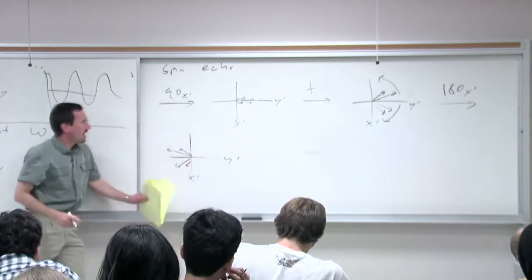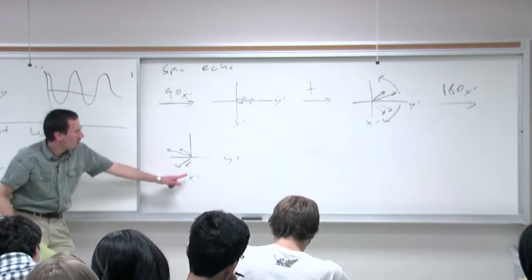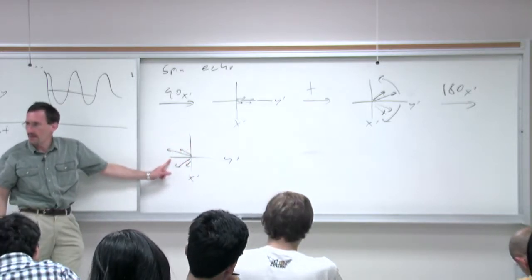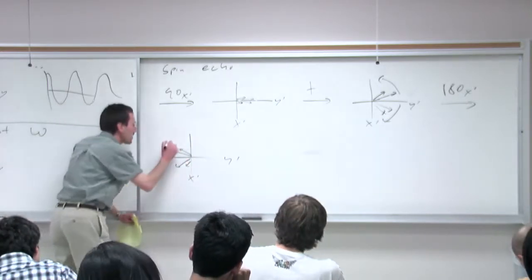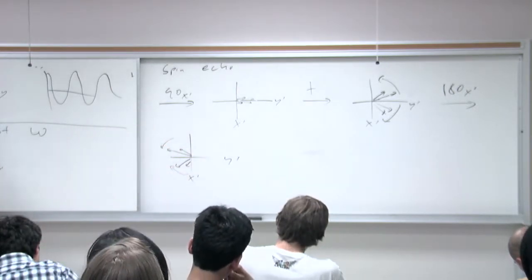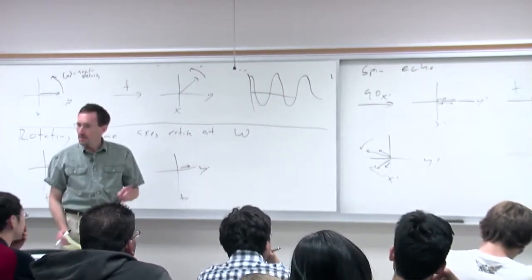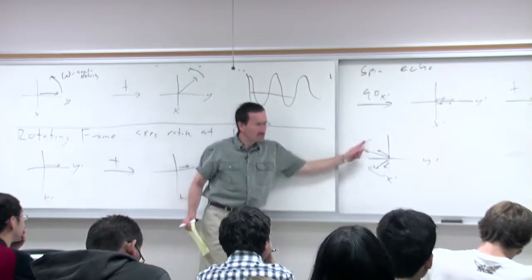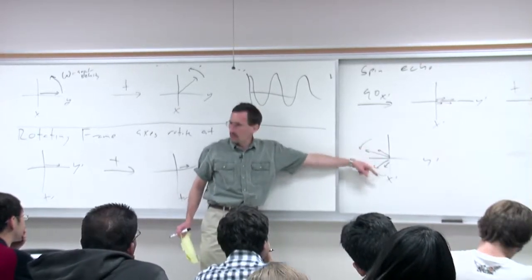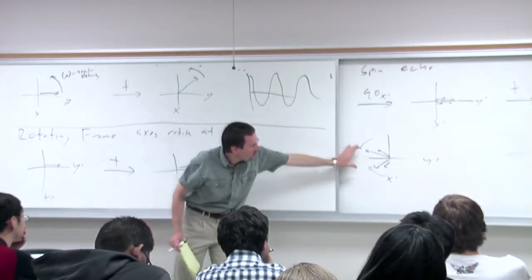Like so. And we do that to all of these different vectors, and they've all flipped around the x prime axis. They've all gone to the negative y prime axis, and yet they are still precessing in the rotating frame, but now they're headed inwards. And that's the key to this whole thing. Because they're still going in the same direction, these ones a little bit faster, these ones a little bit slower than the rotating frame, they converge inward.